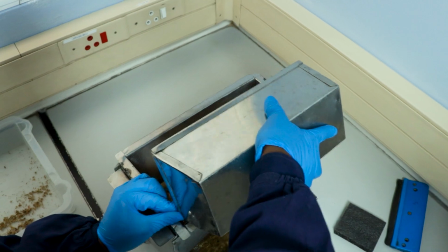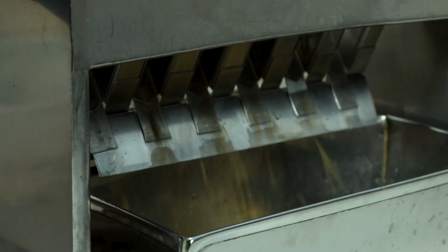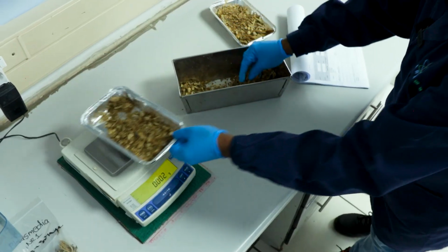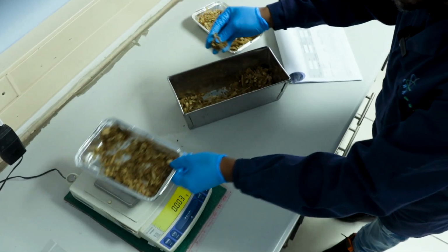And before we do the moistures, we split our samples. The splitting depends on the amount of the sample that we're going to use. More especially, we look at what analysis the sample needs. Then that's where we're going to determine how we're going to split. Is it a big sample or a small sample? Then after splitting the sample, we do our moistures.